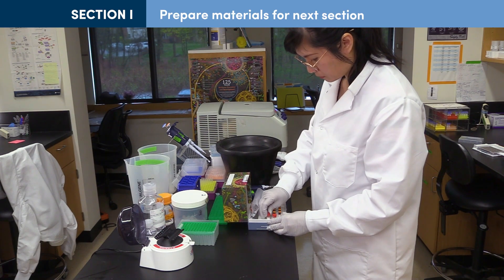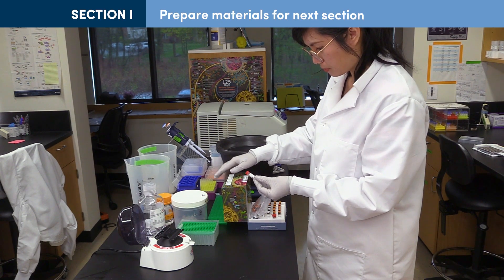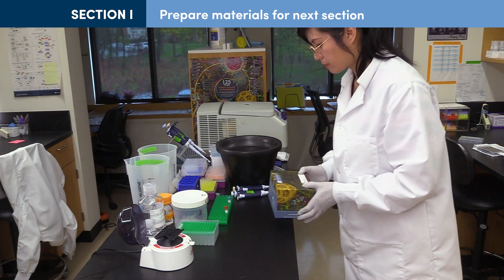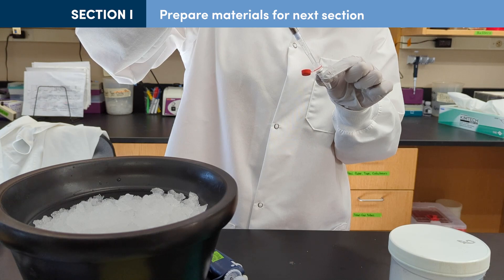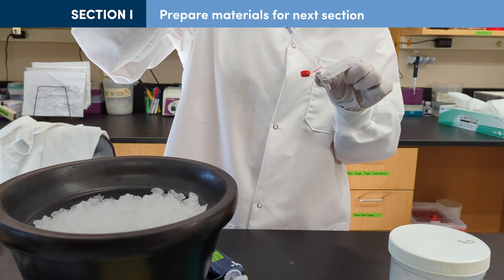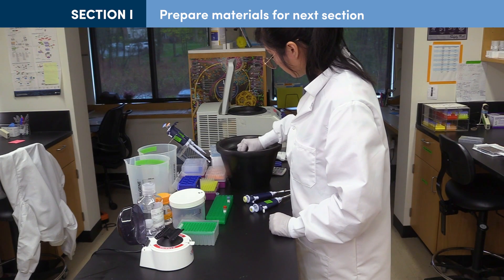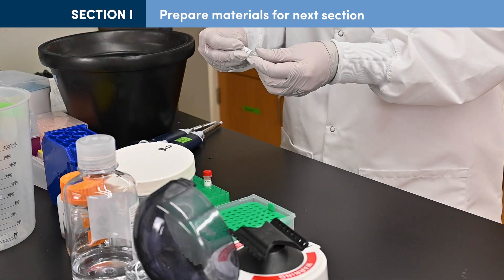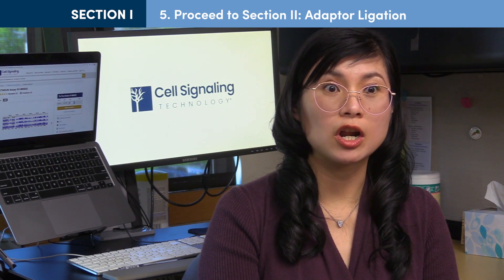Before the end of the thermocycler program, prepare materials for adapter ligation. Thaw the adapter at room temperature. Mix the ligation master mix by pipetting up and down several times and place on ice. Reserve 2.5 microliters of tris chloride for each sample. At the conclusion of the end prep program, proceed directly to adapter ligation. Storage of samples in the freezer can lead to a loss of yield.